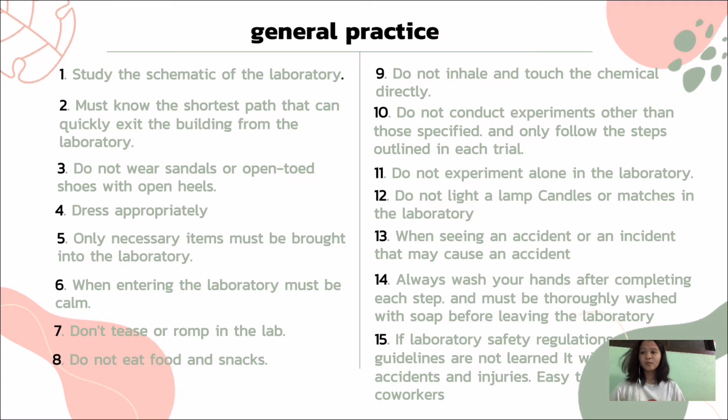Number 3. Don't wear sandals or open-toed shoes with open heels. Wear low-heel shoes that cover your feet to prevent accidents from chemical spillage. Number 4. Dress appropriately. Don't wear shirts that are too tight or loose. Number 5. Only necessary items must be brought into the laboratory.